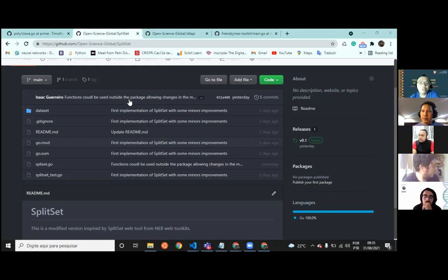I think for primer design, we're currently using Beacon Designer. But we do that one by one. For every primer that we need to design, we have to design it separately, so we cannot do simultaneous primer design. And for integrating barcodes in your primer, I'm not sure, since we haven't done that before. But we're basically just using freewares for alignments, and based on alignments, you just tweak the sequences manually, and then we send the sequences to IDT. So that's how simple things are right now.